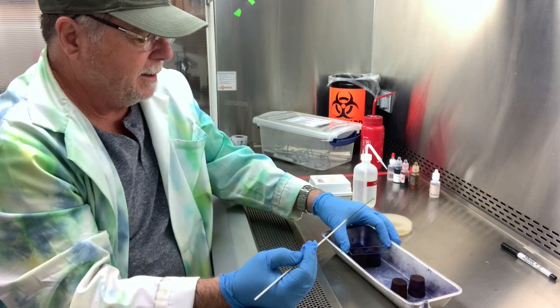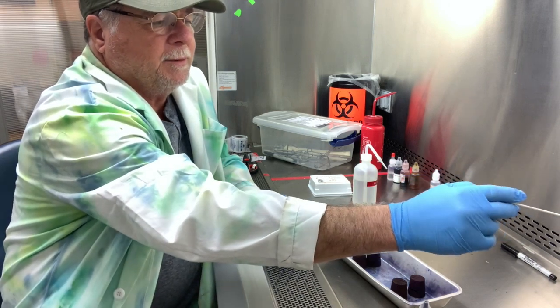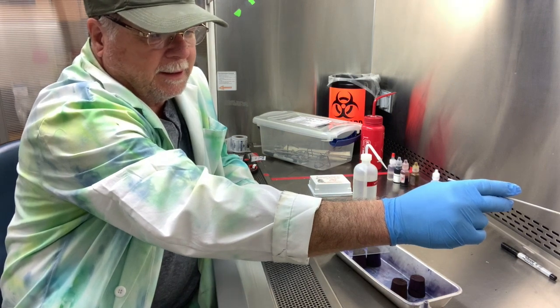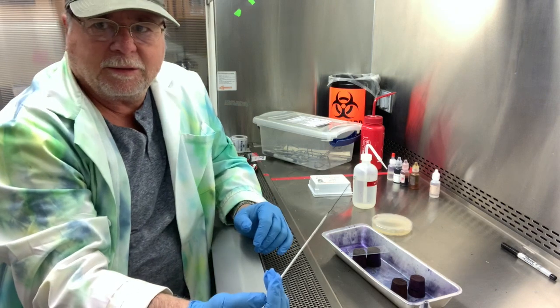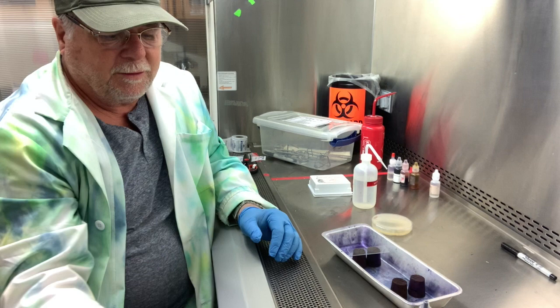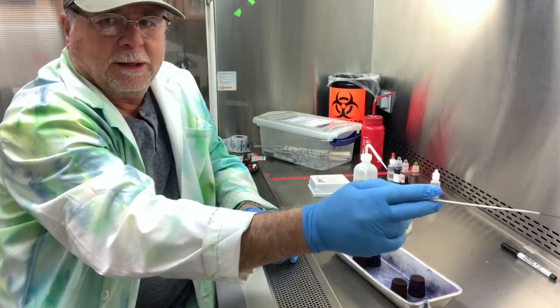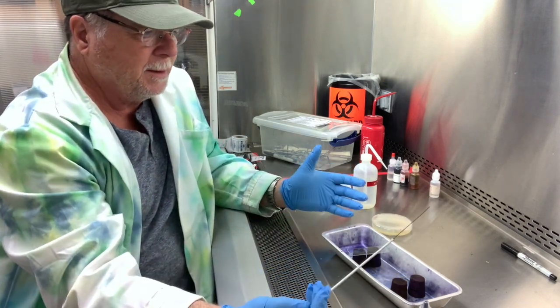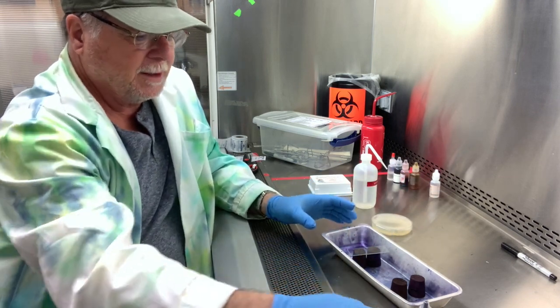All right, and we'll put that there on the corks, and then we have to sterilize this before we put it down, because there's bacteria on it. We don't want to set it on a surface and contaminate that surface. So we need to always know where the tip of this is at all times. You don't want to touch your arm or touch the surface of something. If I miss my hole here in my burner, I have to be aware of that. And so it's not a big problem. I just have to back up and sterilize it, and then go do what I just did.